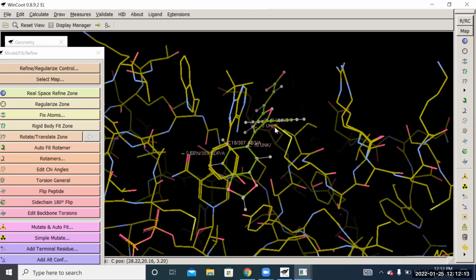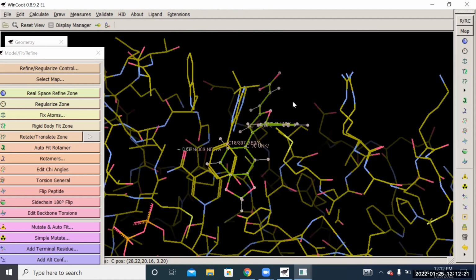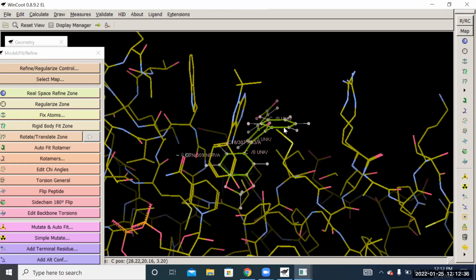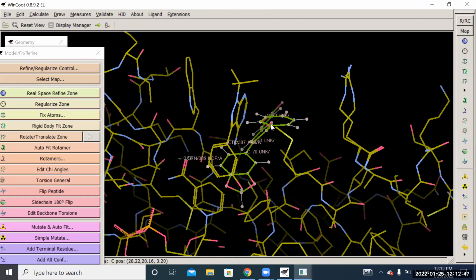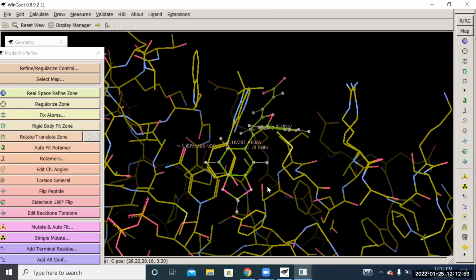But oh, gee, look at this. This methionine 141 is always going to be in the way, and it may be possible that you have to move it in order to free up some space, because look how close it is. It's way too close to this ring. Now, I still would only move side chains at the very end, when you're convinced you have moved this and minimized as many unfavorable interactions. Usually they're too close. So don't go moving side chains, okay? First move this as much as you can, get it in a clean spot.